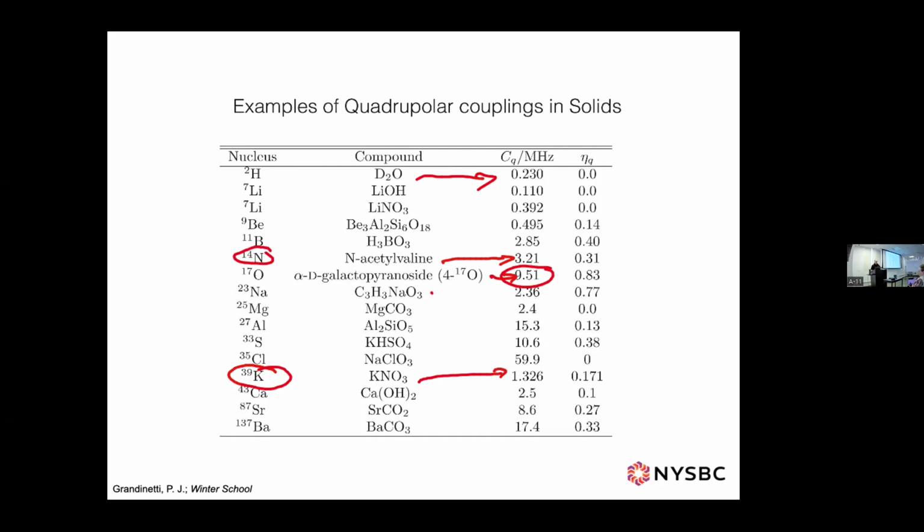But they're both low gamma, right? They're both fairly close. Actually, I'm fairly certain that it's one of the ones that people have tried along with chlorine, where you can actually detect both of them in the same spectrum. So it's really broad, but chlorine has two half integer spin nuclei, 35 and 37. They both have massive quadrupolar couplings, unless you look at something like salt, that doesn't have a massive one because of its tetrahedral environment.